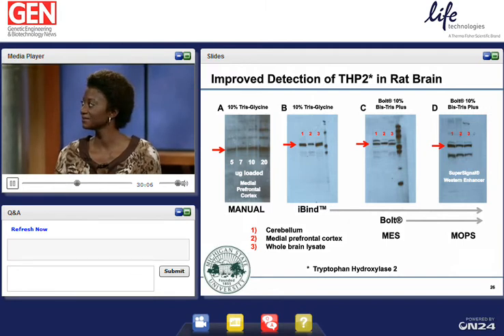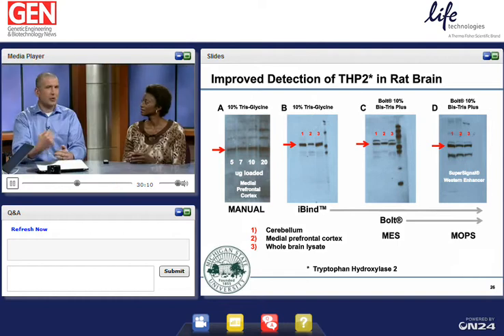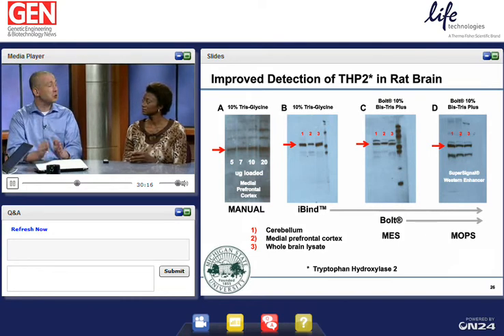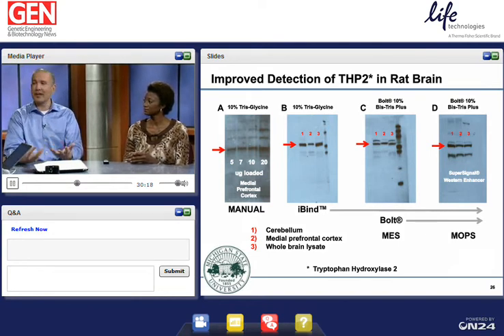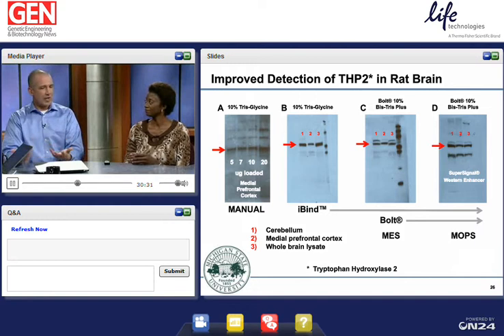Wow. That's great. Before I ask a question, when you said you were using 20 microliters, now you're using 2, it just reminded me that in the previous slides, I was talking about 2 mils of antibody. That's the diluted antibody, right. But people look at it in different ways. Some people say, how much stock antibody am I taking from the stock tube? Now it's 5 times less. Or once diluted, before they might use 10 mils, now they're using 2 mils. Either way, no matter how you word it, it's the same net savings.